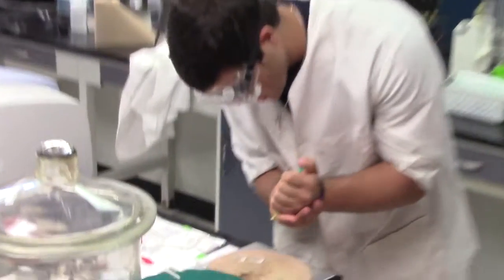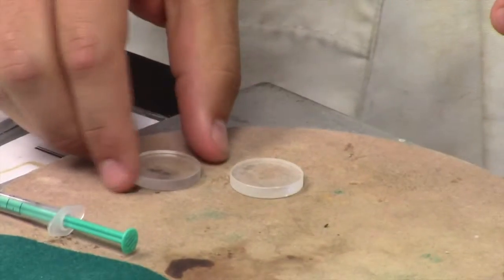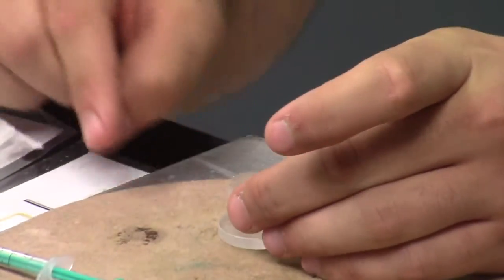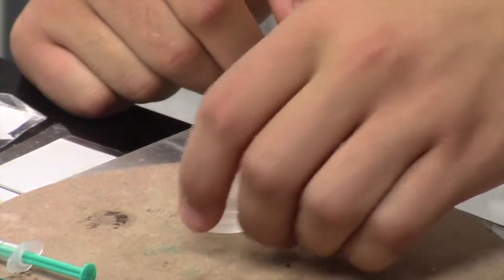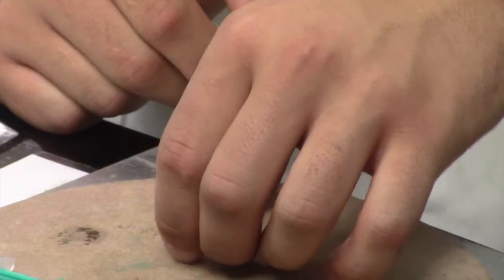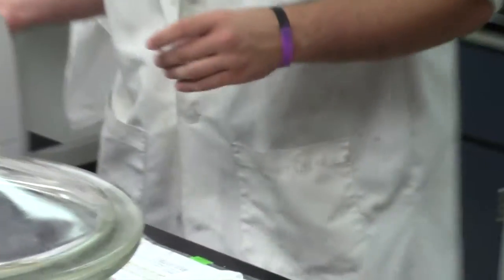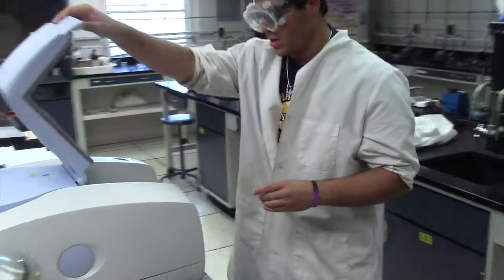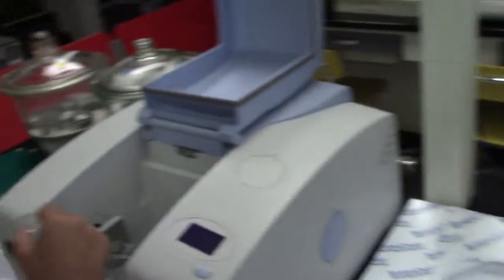Once you've properly cleaned your salt plates, you take your product and you put it on the clean face of one of your salt plates. A little bit. And then you use the other salt plate to make a seal, like so. And then, here's the good part. You get to put it inside our wonderful machine right here.